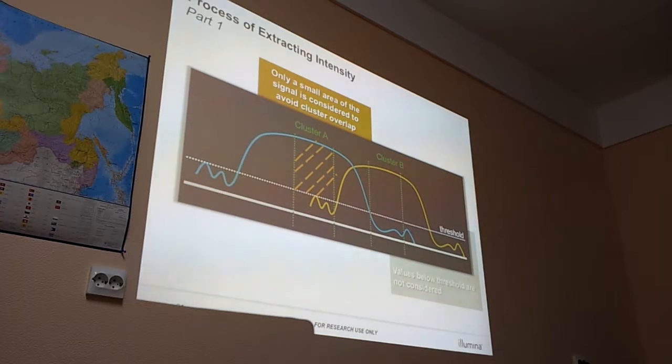So there are different ways. If it's about the index read, also if you have only 2 indexes, it means that in the index read 50% of clusters are identical. So it's better to work with more indexes when the read is of higher quality.